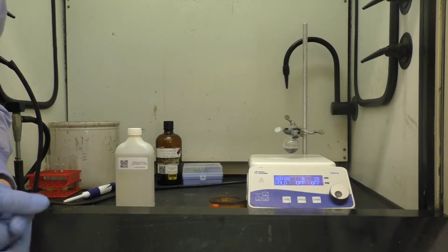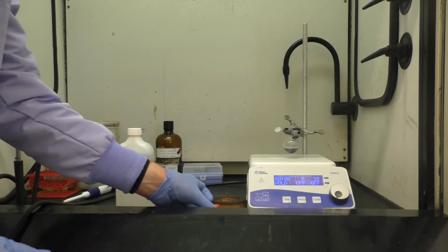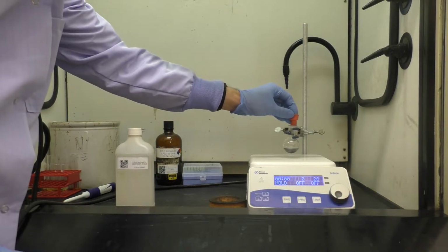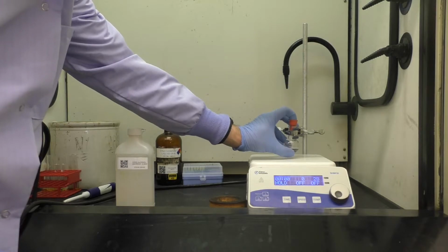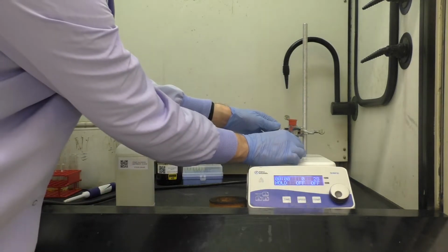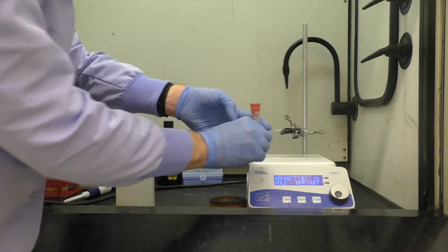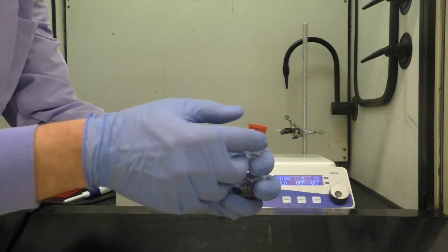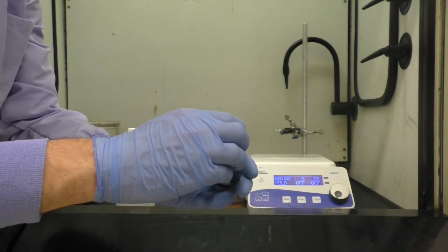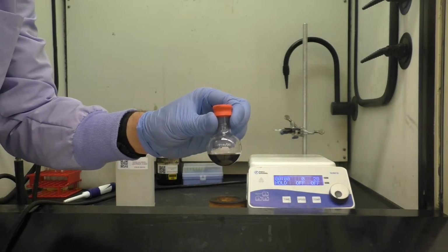And then the last thing we'll do before we add our hydrogen is that we need to have a septum cap. We'll add it to the top of the reaction flask. This will seal the reaction in place. You'll notice I'll need to loosen and remove the round bottom so that I can carefully tighten the wings of the septum cap down around the top. And now you can see here our reaction vial.